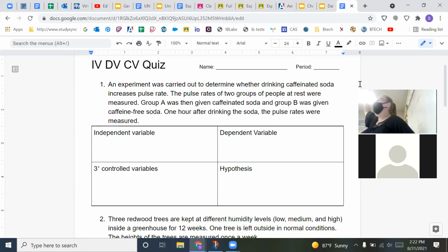Shh. Can you put your foot down, please? We're not that informal in here. Let's make sure everybody has their nose covered, constantly checking for that.